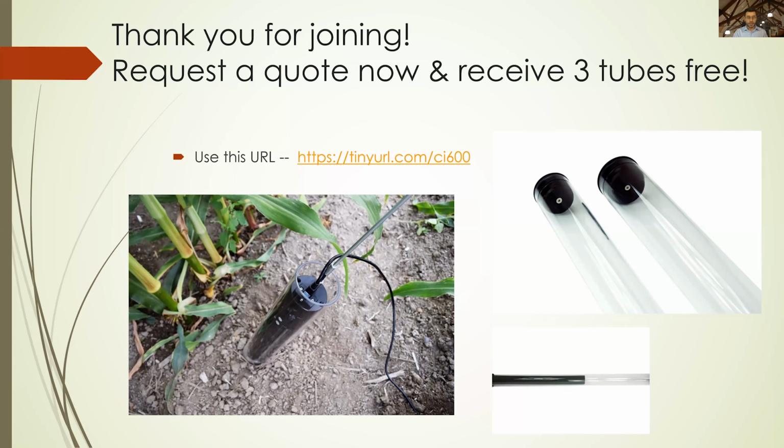And the next question is, can the software automatically log and save the root readings? And the answer is yes. It does log them, does save them, keeps them in a RootSnap file that you can open up later on at any time. You also can save the images themselves, so you can open them in another software or just view them as you would please.